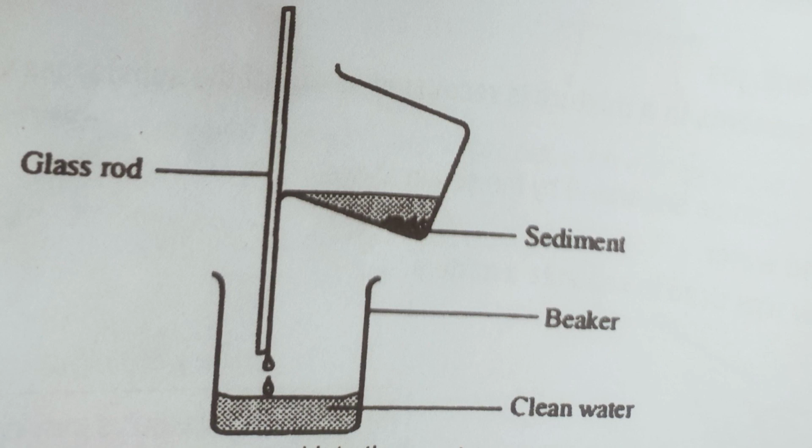Decantation is not an efficient method of separation because some of the solid comes out along with the liquid. The glass rod ensures that the liquid is directly poured into the receiving vessel to prevent any spillage and spatter as the liquid flows along it.